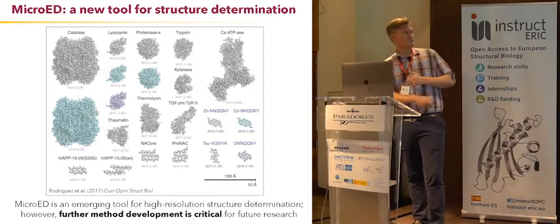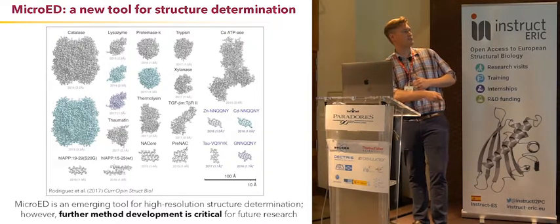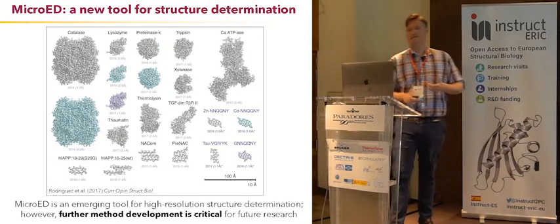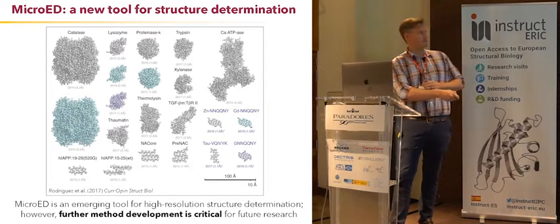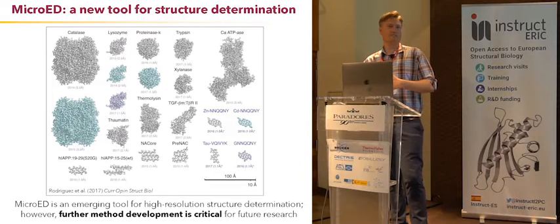A lot of these peptides, especially this one here, they had been trying to get diffraction data from for, I think, over 5 years. They tried XFEL, they tried everything, they couldn't get it, and then we solved this structure in about an hour and a half, I think, when we finally got the electron diffraction data. So when it works, it works really well.